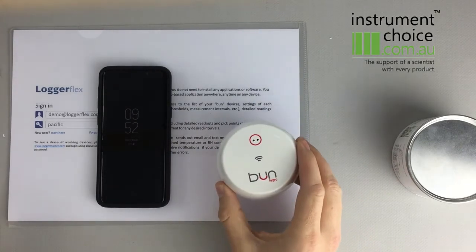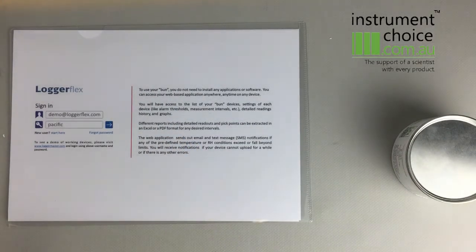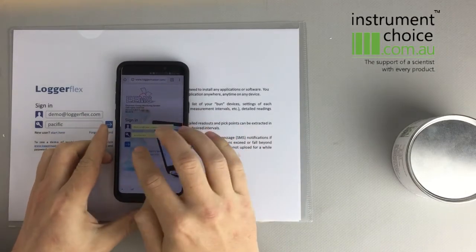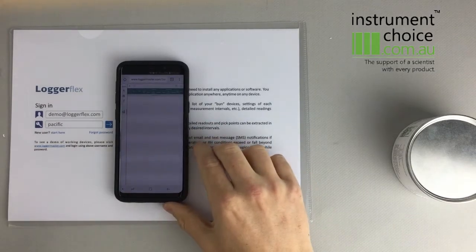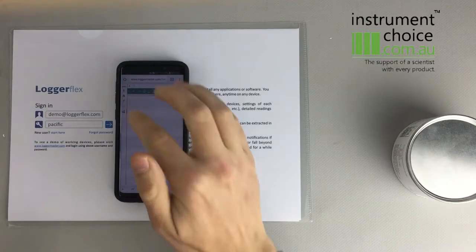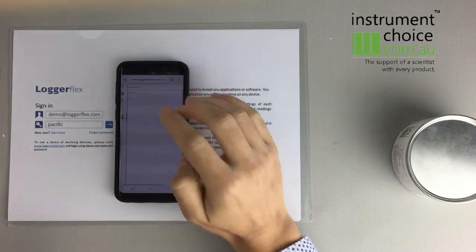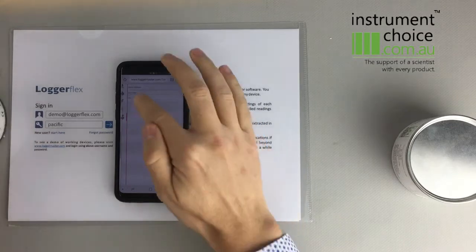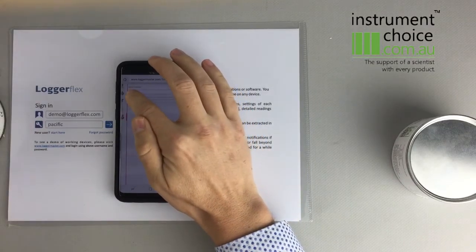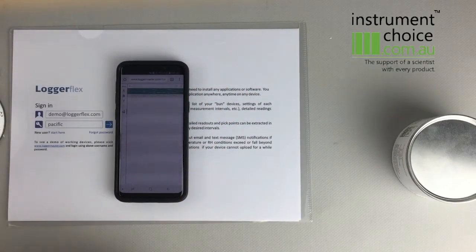Our first step is to set it up on the Logger Master account. I've already created an account so I'll just log into that now. As you can see, this is the account interface — we'll just sign in. Now our next step is to claim the logger. You go to the plus button, which takes you into the serial number and the device ID. These are housed within your can. We'll input them now, click the checkbox, and that'll claim the device. As you can see, it's shown up within there.